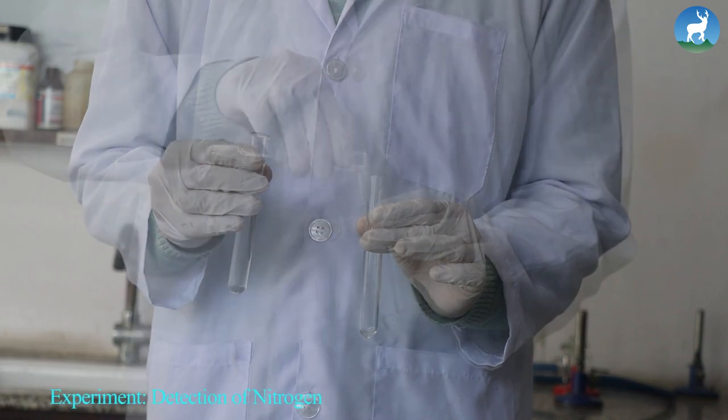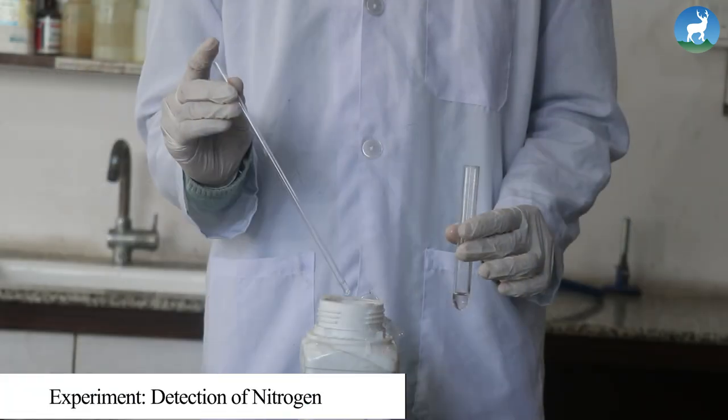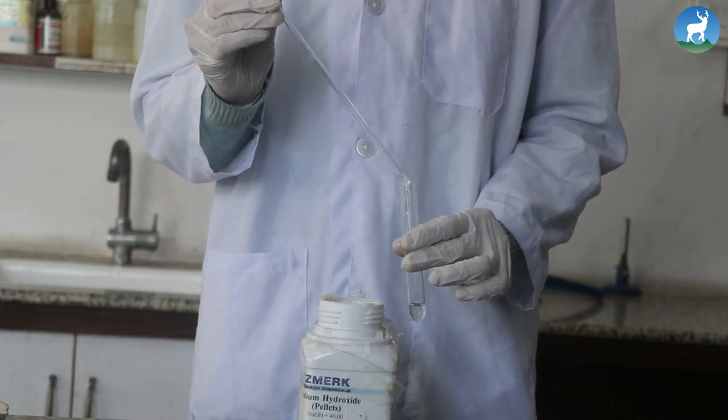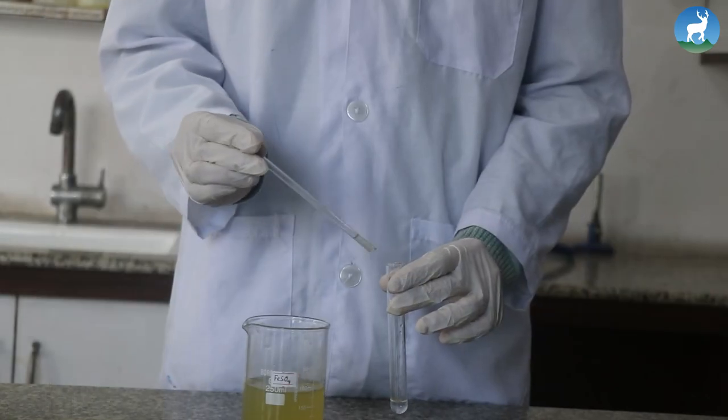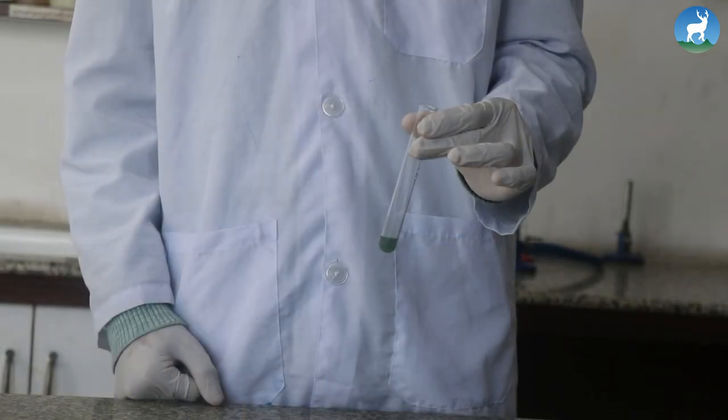Detection of nitrogen: Take 1 to 2 ml of sodium extract in a test tube. Make the solution alkaline by adding few drops of aqueous sodium hydroxide. Add few drops of freshly prepared ferrous sulfate solution. A dirty green precipitate is obtained.